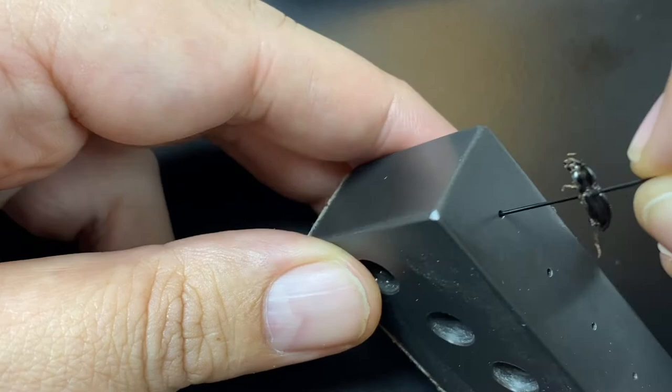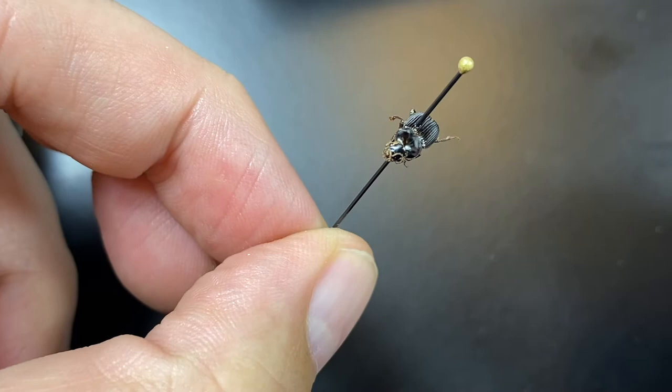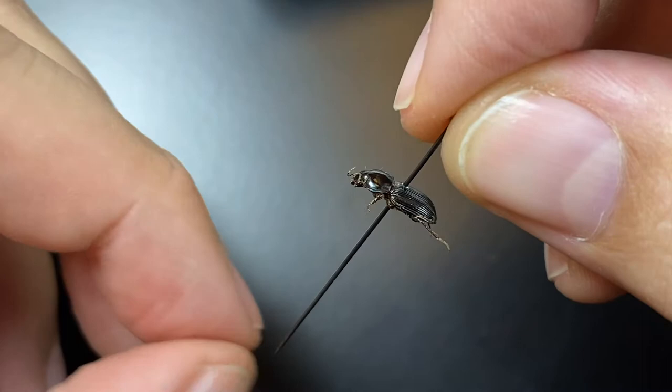This specimen we might consider complete. This is a medium-sized specimen. The pronotum is a little bit wonky, but we can adjust that. We can even adjust the legs a little bit. And that's probably good to go, and we can label it.